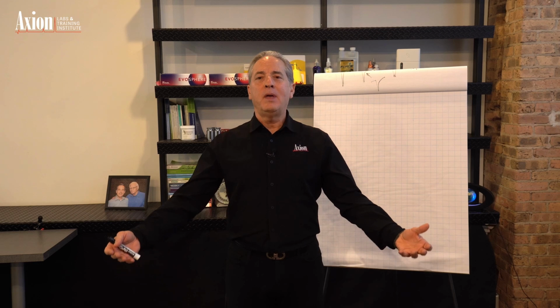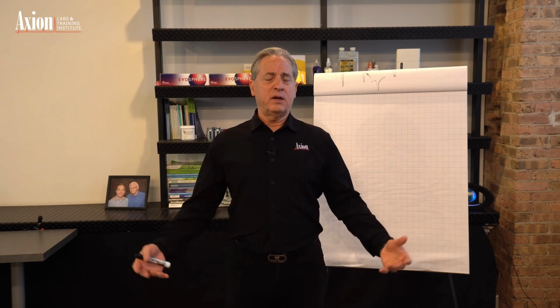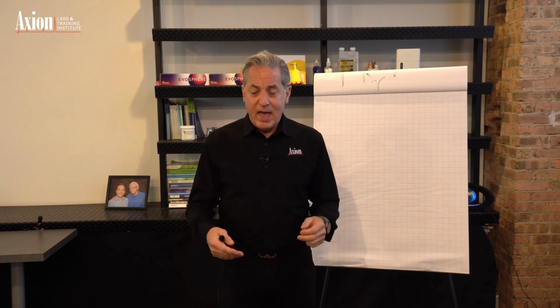Whoops, that's a problem. All of our HPLCs historically could not go to high enough pressures. So we've been limited by the pressure capability of the instrument. Let's say you have a bunch of what I would call standard HPLCs. I probably have 5 regular LCs and 5 UPLCs in the lab. I would define up to 6,000 PSI as a standard LC. You've got a standard LC, and you see the guys across the hall with their UPLCs buying these 1.8 micron particles. You can't do that because you don't have the pressure capabilities.